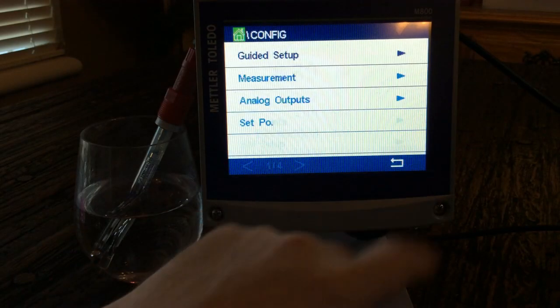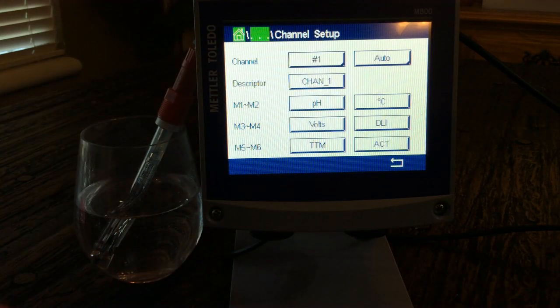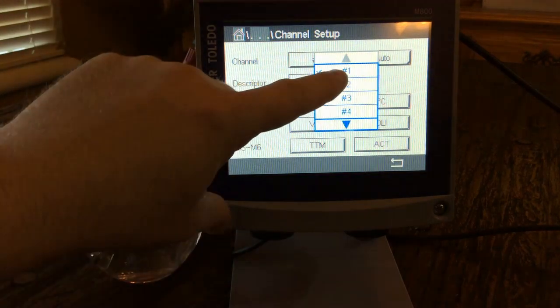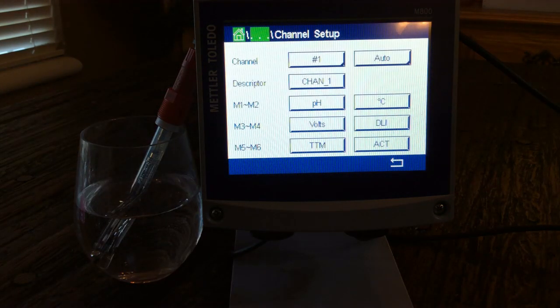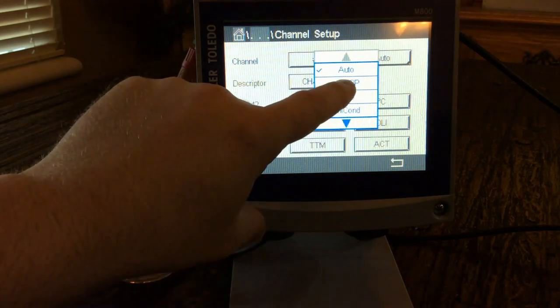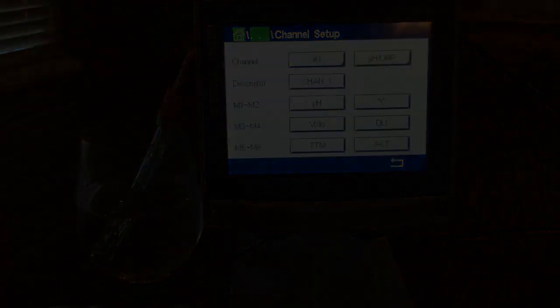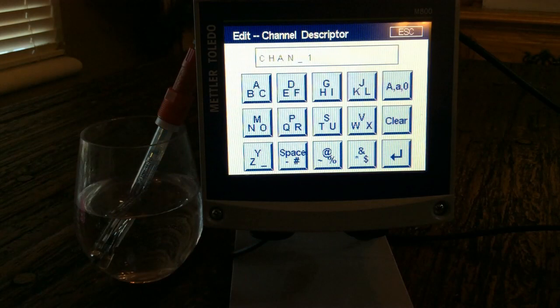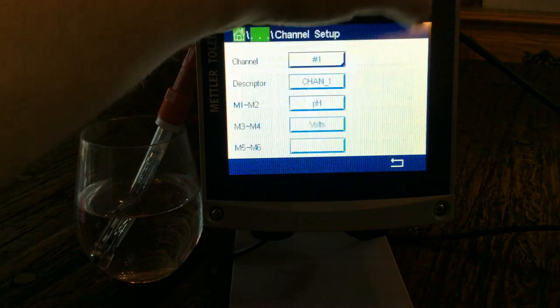Next let's look at settings. You can go through a guided setup, or go directly to measurement channel setup. Here we have four channels; I only have one hooked up, set as auto — meaning no matter what I hook up, as long as I use that same sensor cable, it will automatically read and start measuring. If you set it to PH/ORP only, connecting a DO or conductivity sensor to channel one will give an error message. You can also label channels — boiler number one, plant one, or whatever you want.